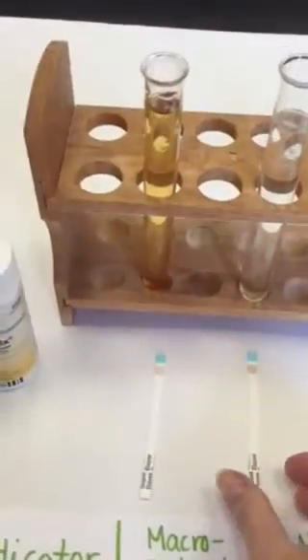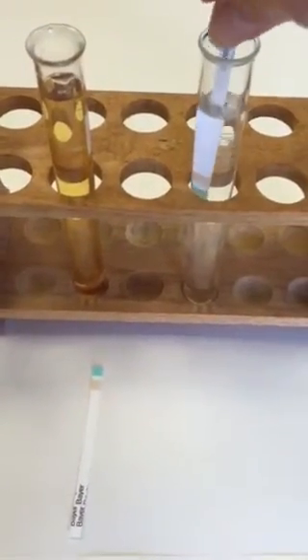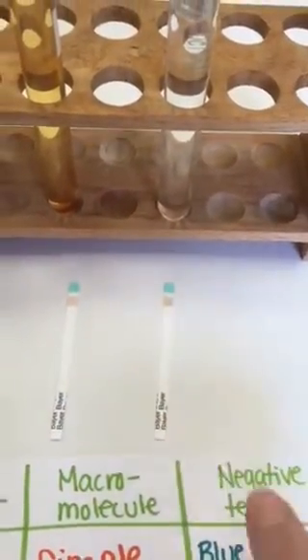Let's test first in our water. So far I don't see a color change — it's still that same blue turquoise color.